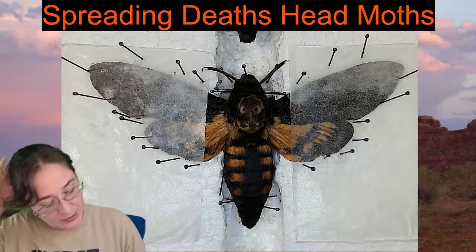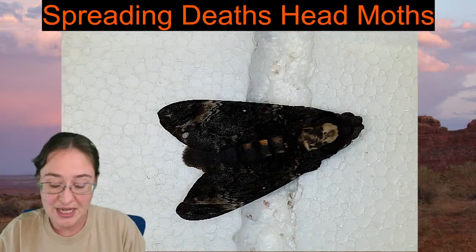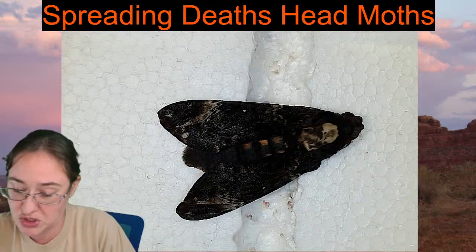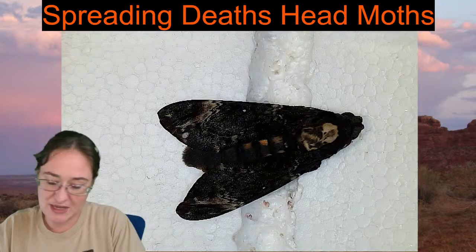Alright, so this is a glassine envelope. It is a butterfly and a moth envelope. So that's the envelope that this moth has come out of, and it doesn't wipe the scales off of its wings. After I take the moth out of the envelope, I'm actually going to open it up. The envelope is still just a little bit wet from being in the relaxation chamber, but that's all right. It's going to dry too as we are spreading our moth. And I always cut the edges off so that we have one flat rectangle without any of those seams, because sometimes those seams get in the way.